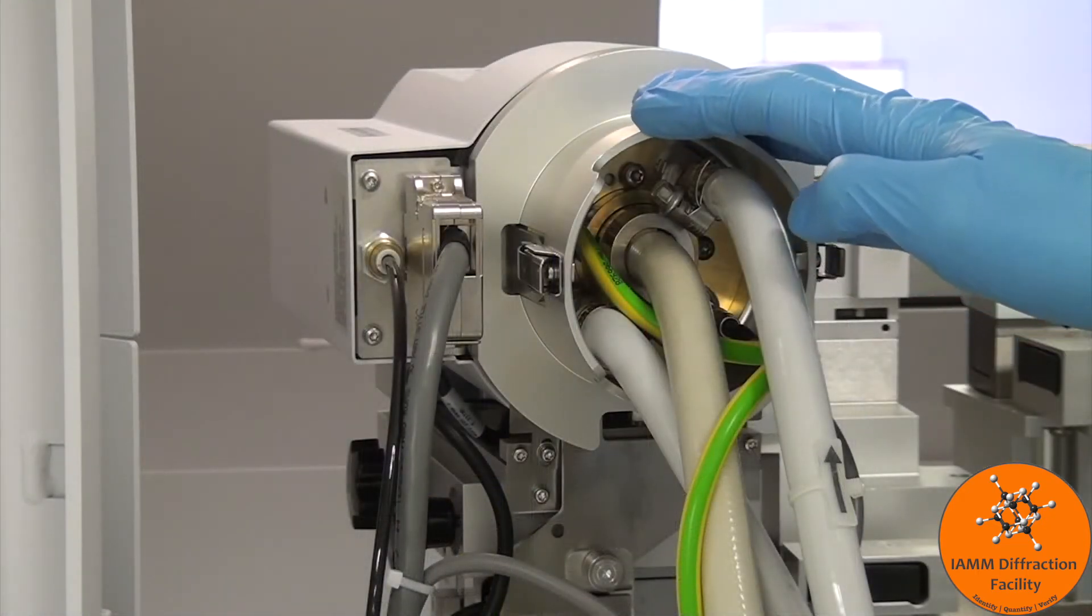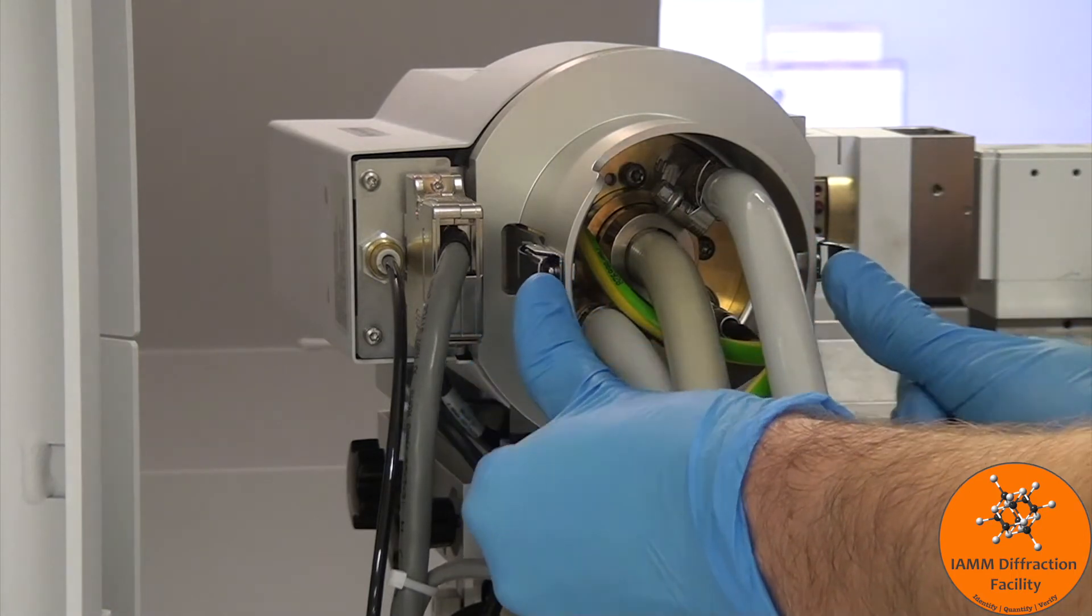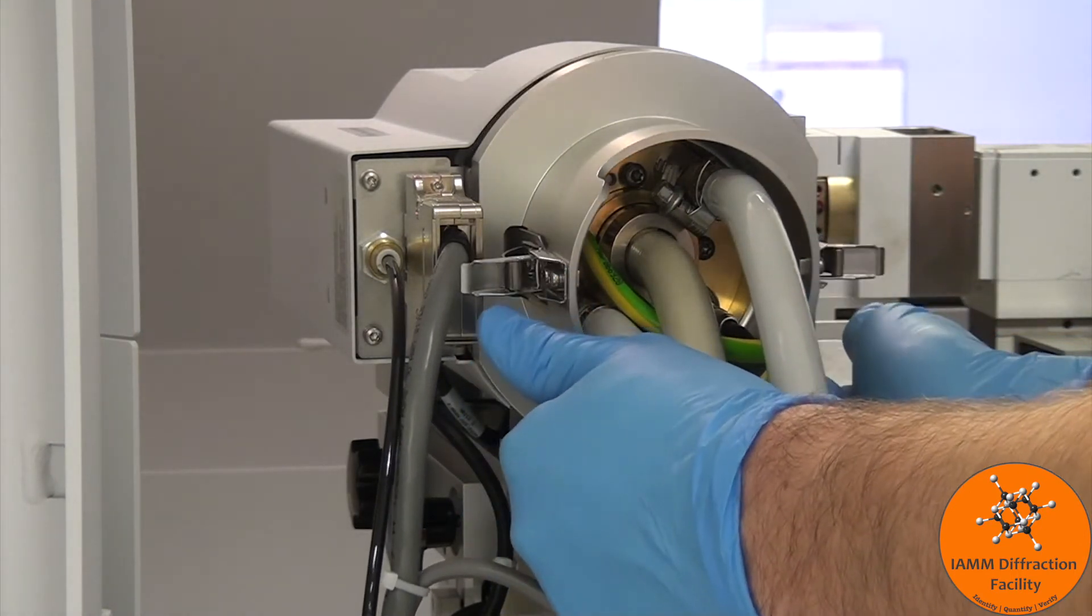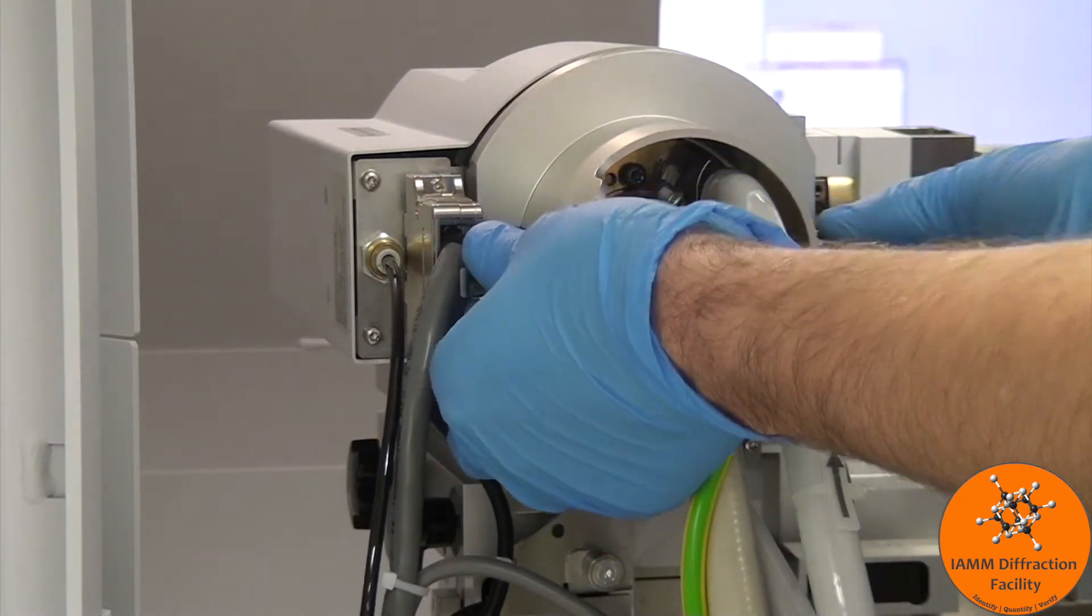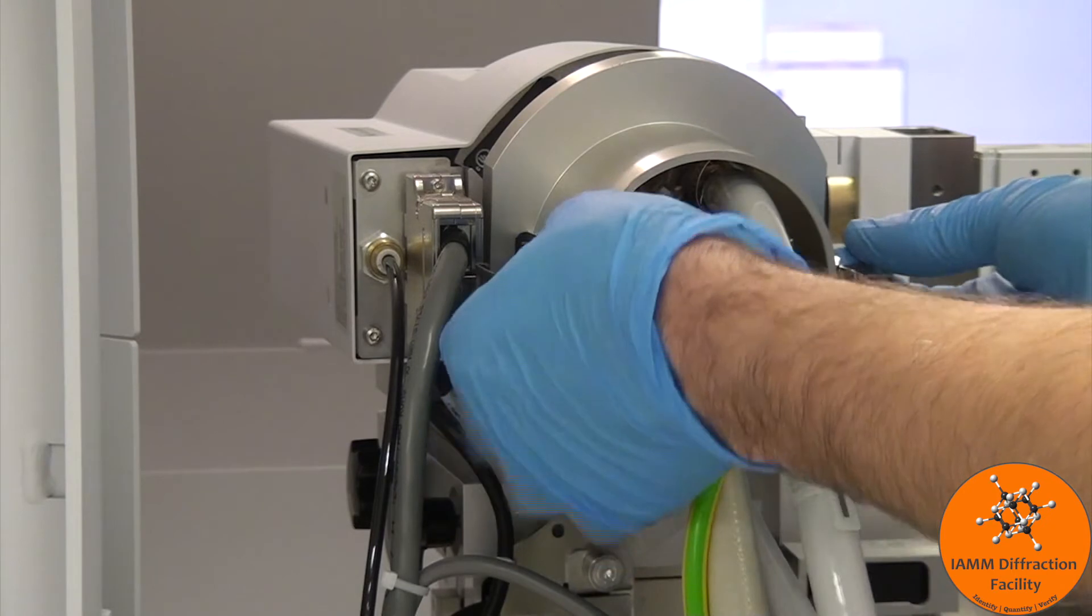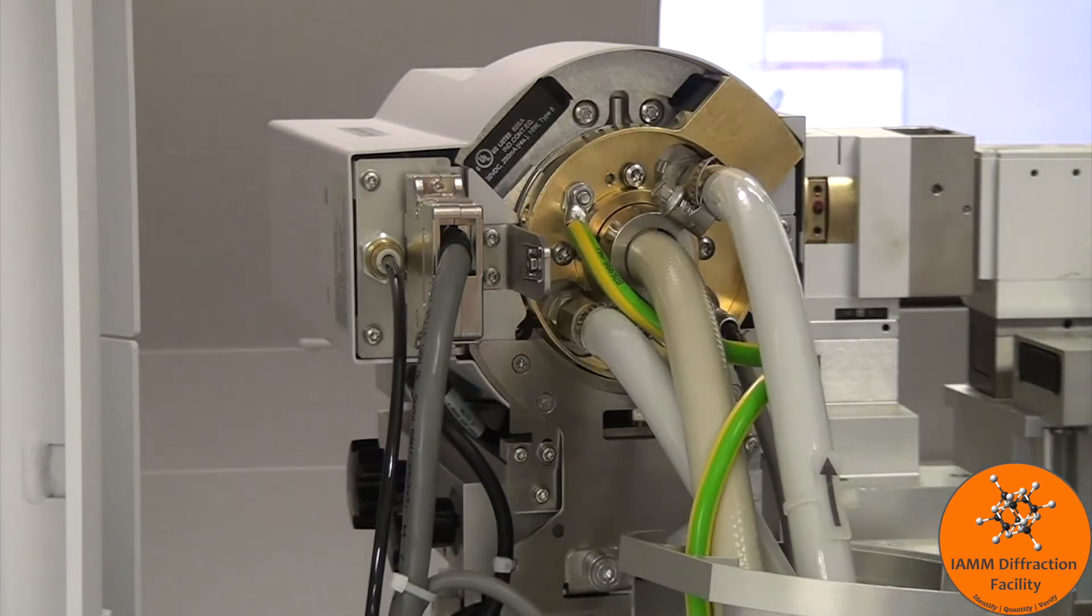Here we see the back of the x-ray tube so we want to push these two clips forward to loosen the collar. We have to work these hooks off where they latch onto. Pull it back to let it rest down there on its own.